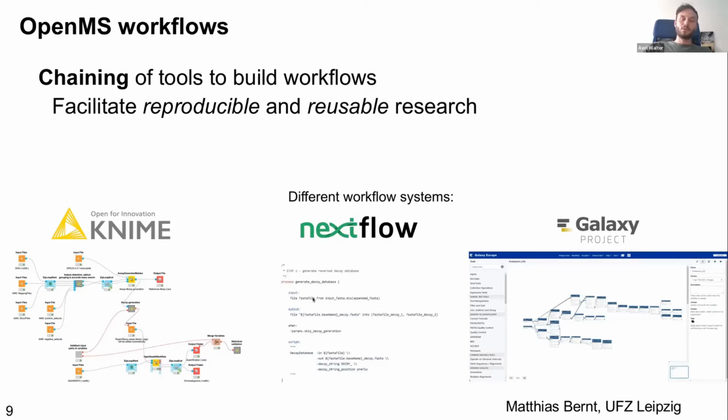And in Nextflow, you define all the steps in your workflow in one of these scripts here. And then you can take that and run it on a very powerful server or on a cluster. So if your local computer is too slow, you can do it like that. And this also makes it easy to automate stuff.